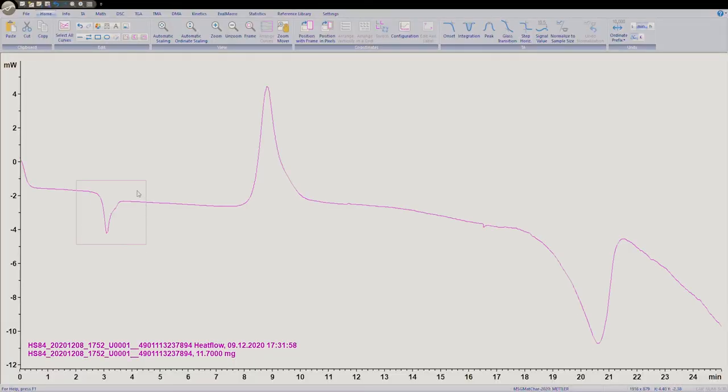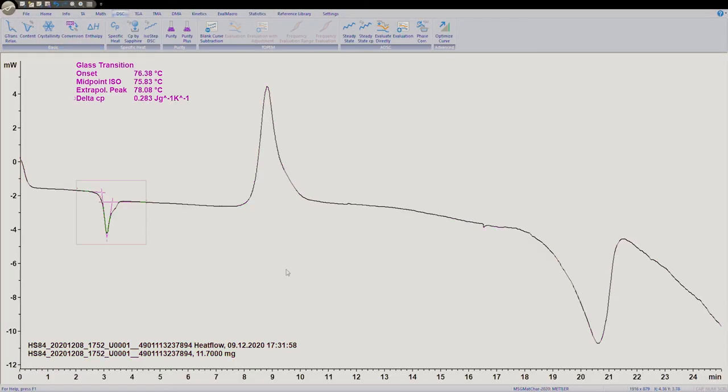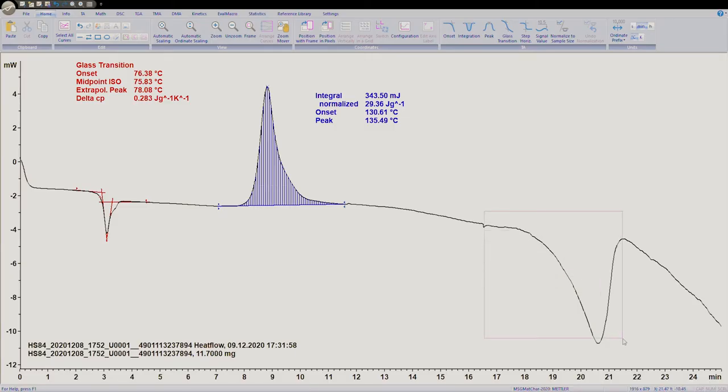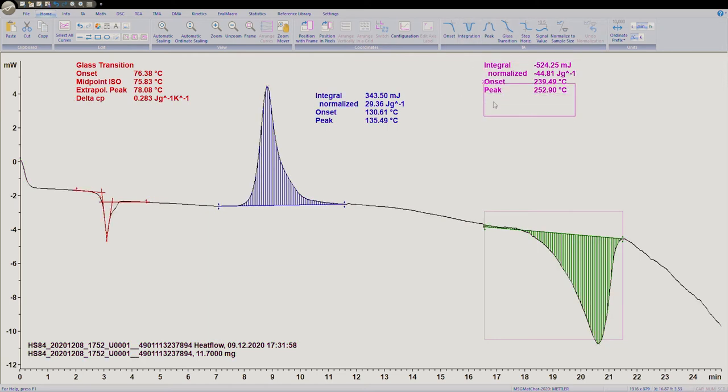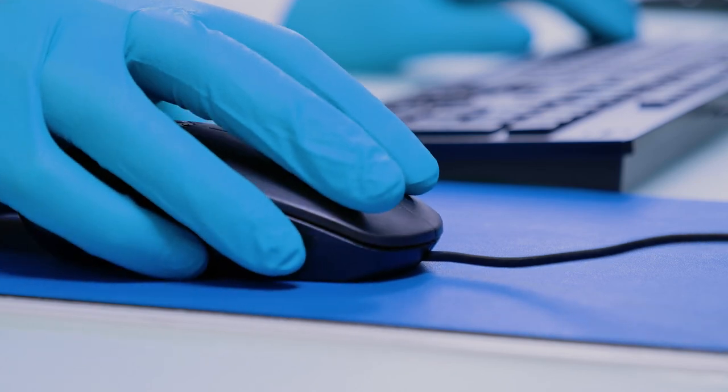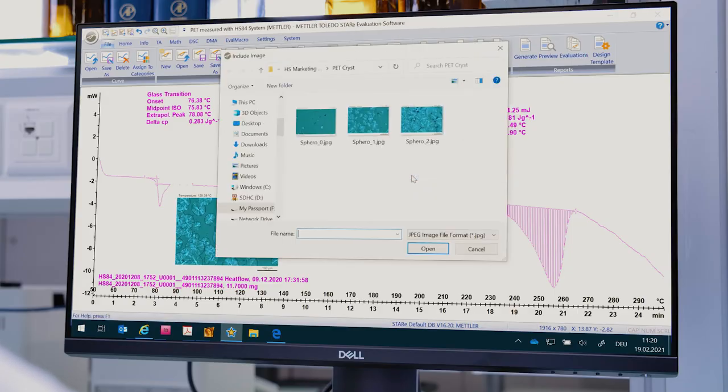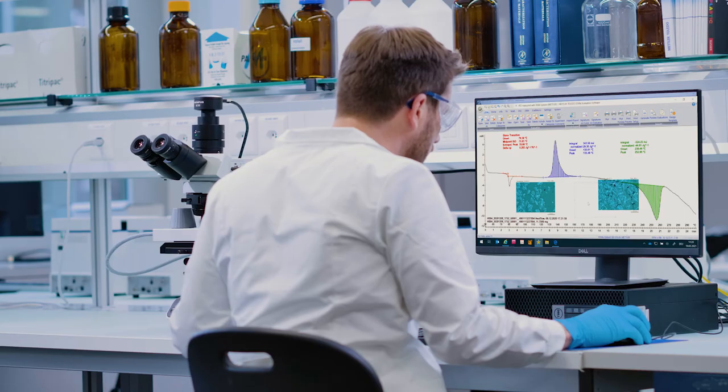The system HS84 delivers real DSC curves with correct heat flow units in milliwatts. Highlighted details support you in determining the characteristic values like onset temperatures, delta Cp values, and transition enthalpies. As an additional unique feature, the software easily allows attaching images.